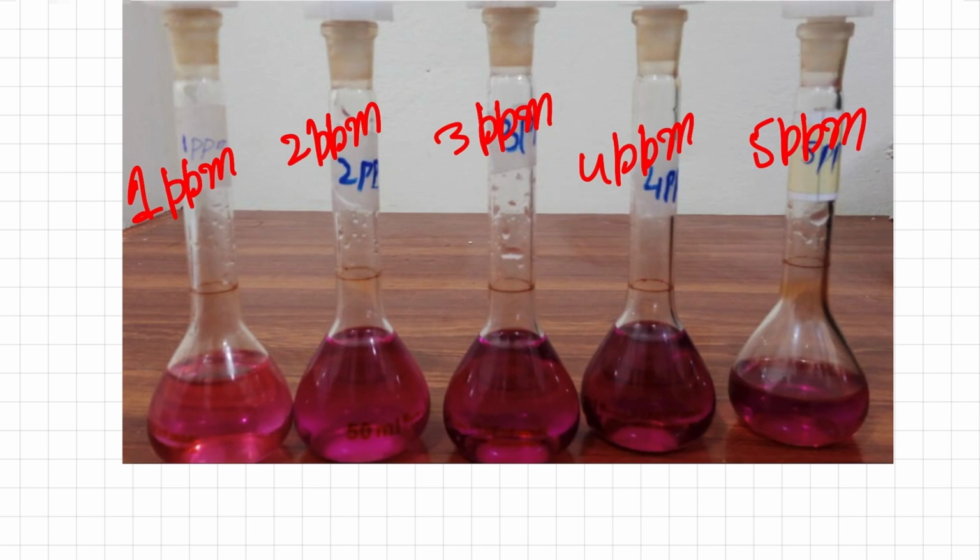For example, your solution contains approximately 0.5 ppm concentration, which is below the detection limit of the instrument, so the instrument measures this concentration as 0.